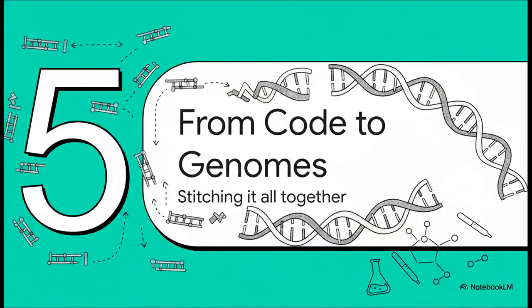So this automated cycle is amazing, but it does have a limit. It can only reliably build DNA strands, or oligos, up to about 150, maybe 200 letters. But entire genes are thousands of letters long, and genomes are millions. So how in the world do we get from these short fragments to the really big stuff?